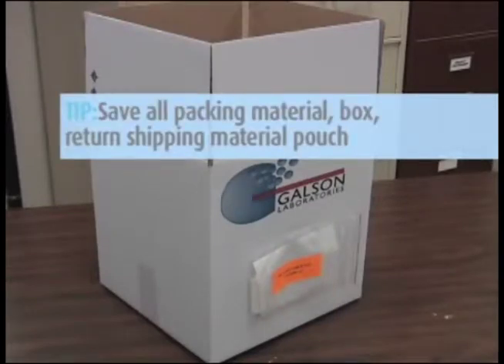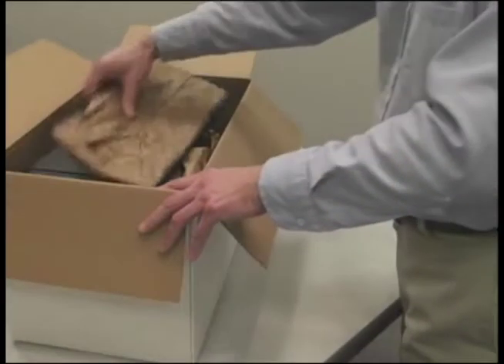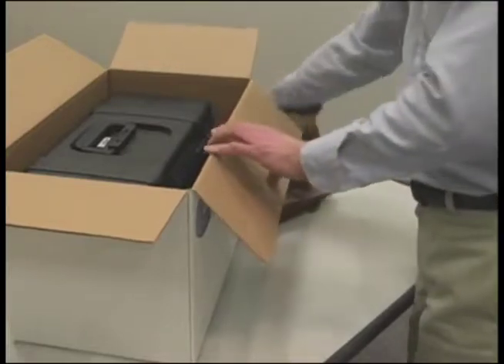Tip: When unpacking rental instruments, be sure to save all packing material, original shipping box, and return shipping material pouch. Unpack all equipment, keeping all shipping containers and packing material. These will be used to repack and ship everything back to the laboratory.